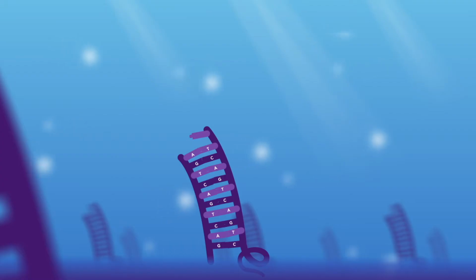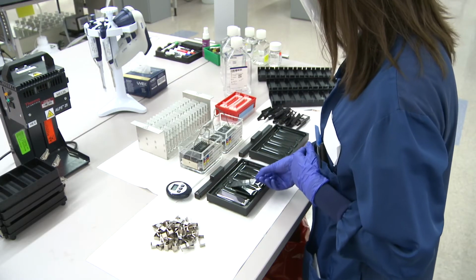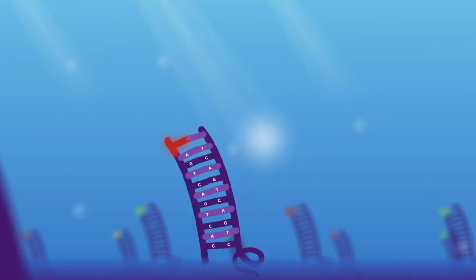Once a piece of your DNA hooks up with its probe soulmate, we want to look at the letter in your DNA that comes just after the end of the matching probe. And to do this, we use colorful fluorescent dyes. Ooh, color! We wash your chip with a mixture of fluorescent red and green dyes that are attached to loose DNA letters. So A's and T's are labeled with red, and the C's and G's are green. And whatever color letter combo sticks to the end of the probe tells us which variant you have at that location.